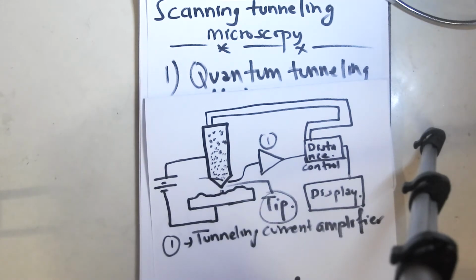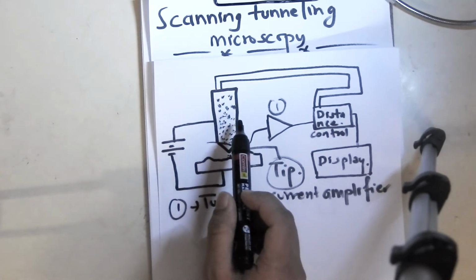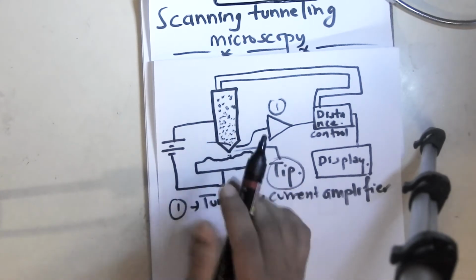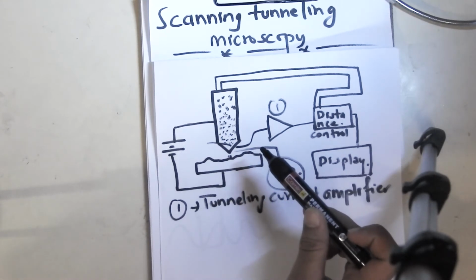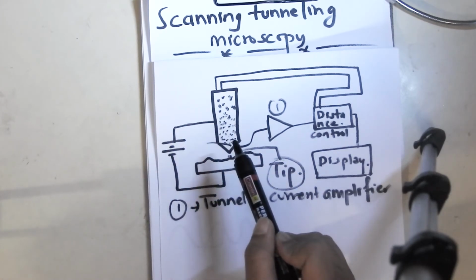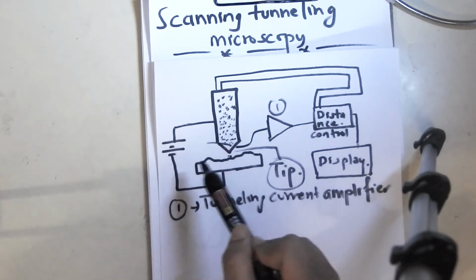It has wide application in molecular science, also called nanotechnology. Components of STM, scanning tunneling microscopy, are metal tips, piezoelectric scanners, current amplifiers, and a feedback loop. The basic idea is to bring the fine metal tip in close proximity, a few nanometers, to a conductive sample. By applying a voltage between the tip and the sample, a small electric current can flow from the sample to the tip or reverse.